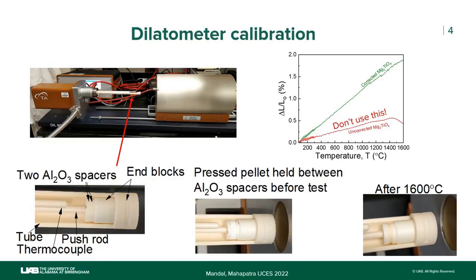Any more questions? Yes. You mentioned that the thickness has to be very precise, around 3 millimeters. Yes. You can have 2 millimeters, you can have 1 millimeter. It doesn't matter, but if you choose 1 millimeter, be 1 millimeter in all of your samples.